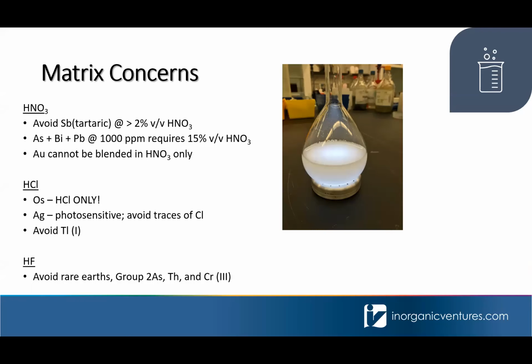Okay. You also want to avoid the use of thallium+1 in HCl matrix. So you'll need to be aware of the state, the chemical form of thallium if you want to use that in an HCl matrix.